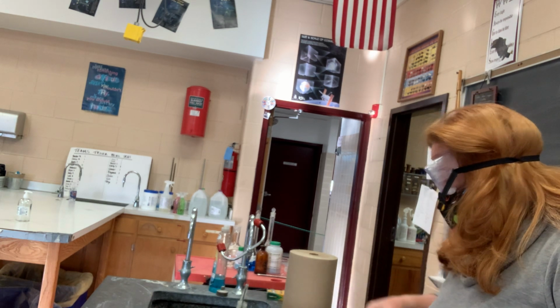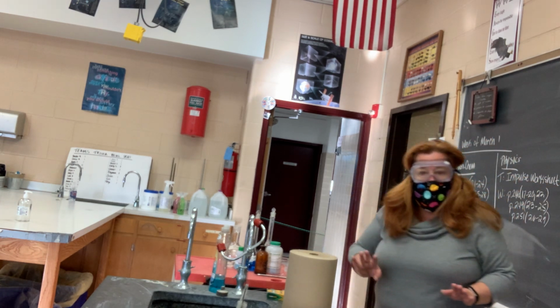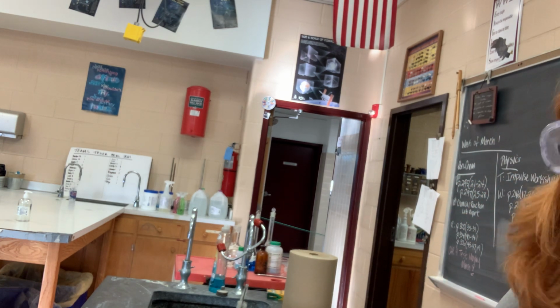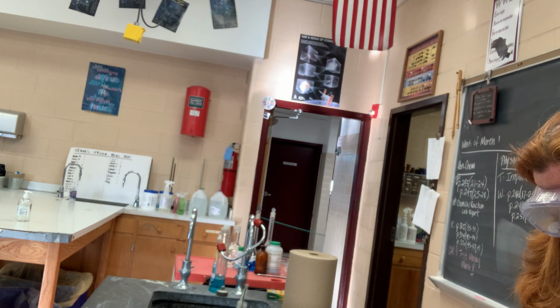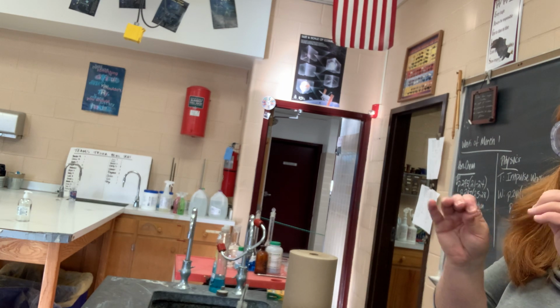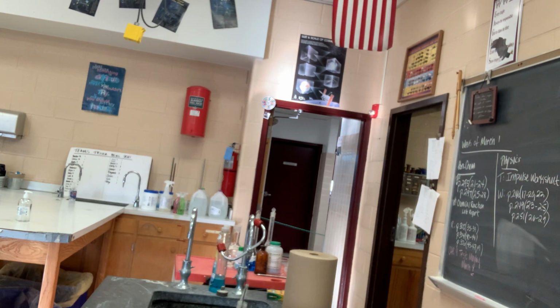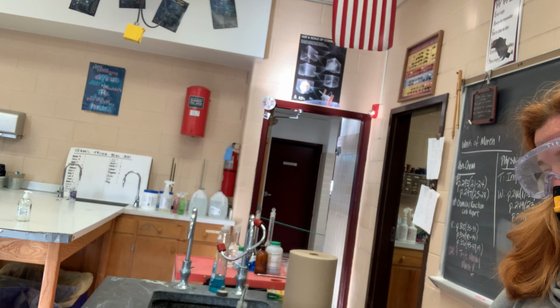Okay, part B, not nearly as exciting. I have copper wire. I can't cut this with my fingernails. I have to use wire cutters. Copper wire is still bendable, but it's harder than the magnesium. There's some corrosion on it as well as insulation, I think, unless this is uninsulated, but I don't remember. So I'm going to clean it up. I'm going to take the insulation off.